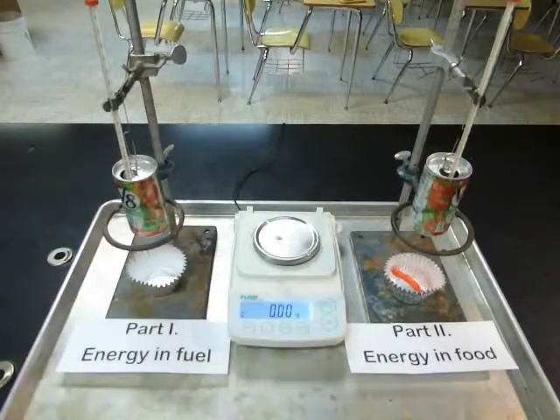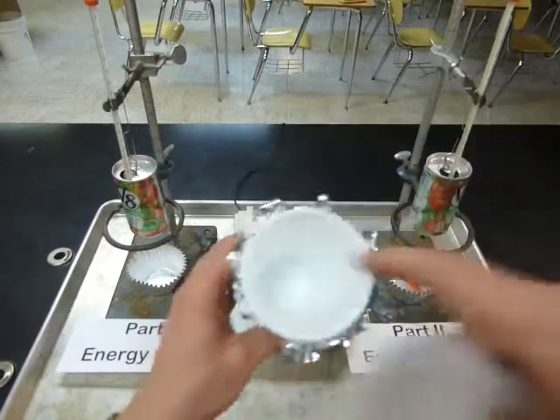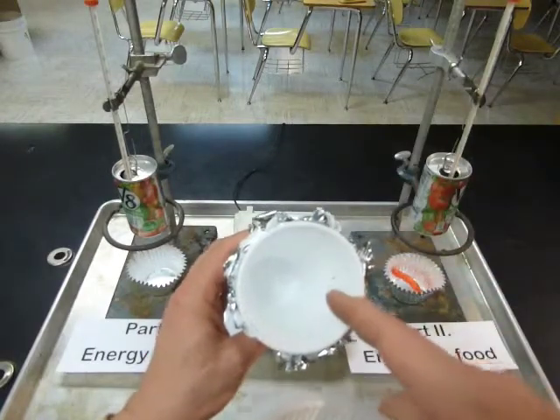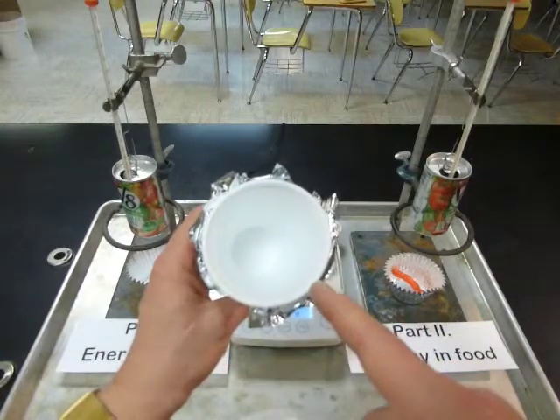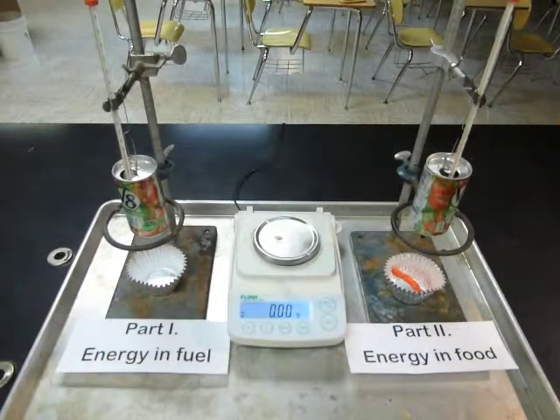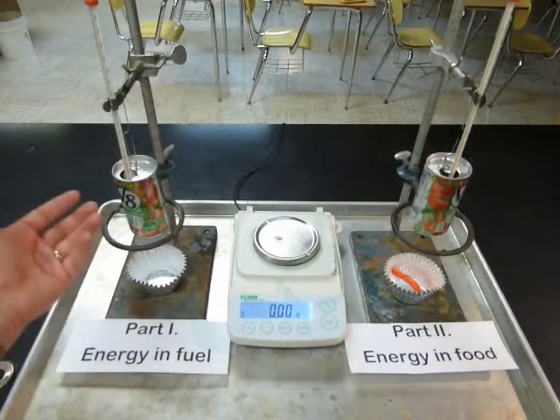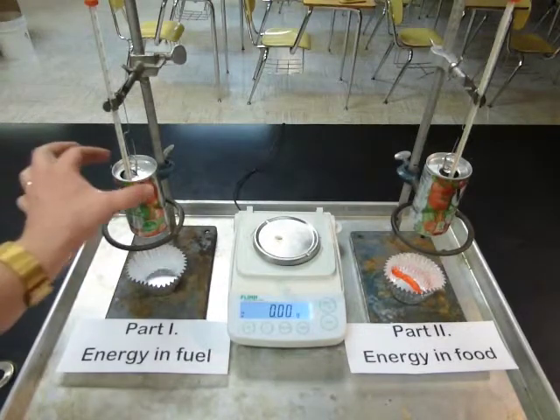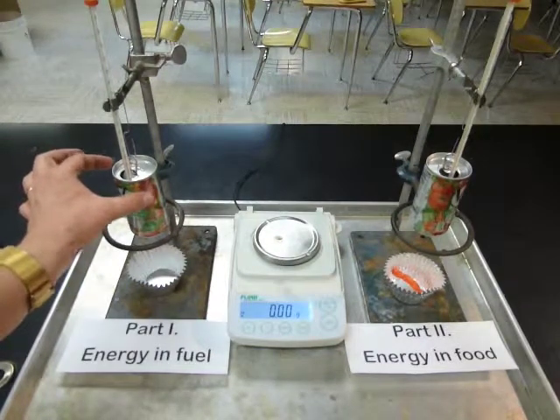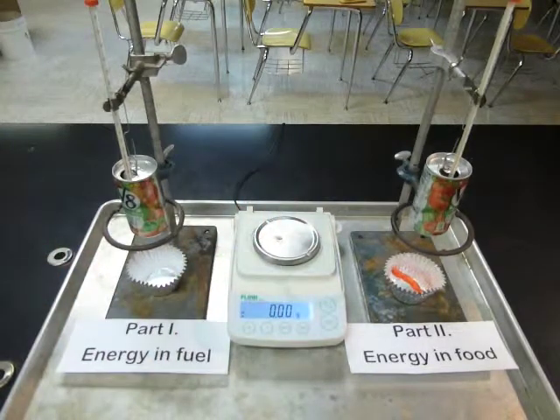Now, a couple things about the calorimeters that we're using. Before, we used a calorimeter that was closed and insulated so that all heat exchange took place inside. But since we're going to be burning things, that won't be possible inside of a styrofoam cup. So when we burn things below our calorimeters and the heat escapes and goes into the can and heats up the water that's in the can and also the metal that's in the can, a lot of the heat is going to get lost. So some of our results are going to be inaccurate.